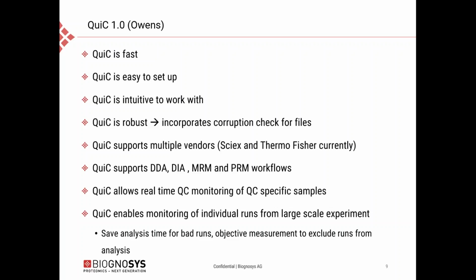The tool allows real-time quality control monitoring of specific QC samples, but also enables real-time monitoring of individual runs from large-scale experiments, and thus can save the user some analysis time, because the tool enables you to objectively exclude certain runs from downstream analysis.